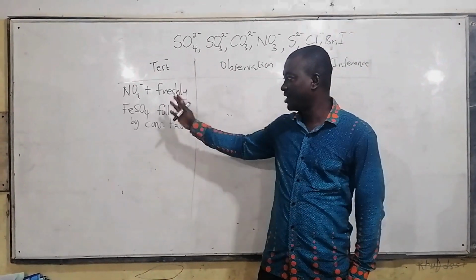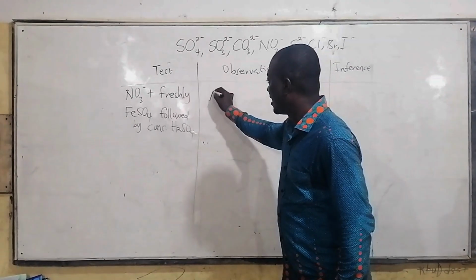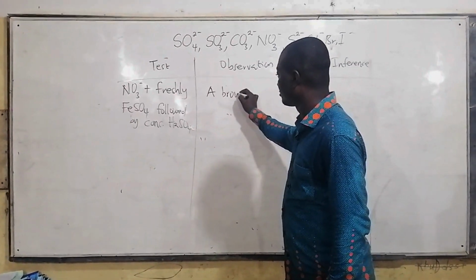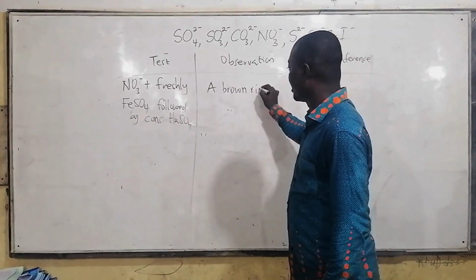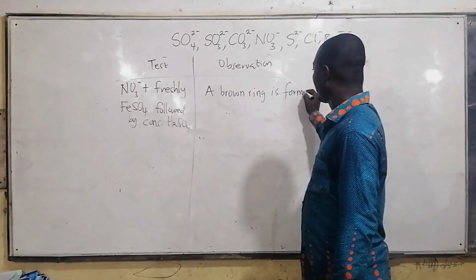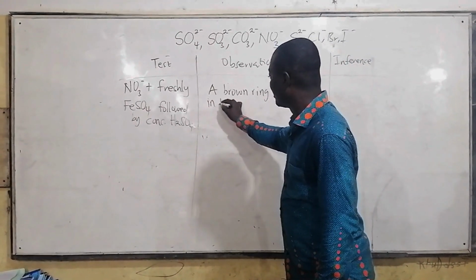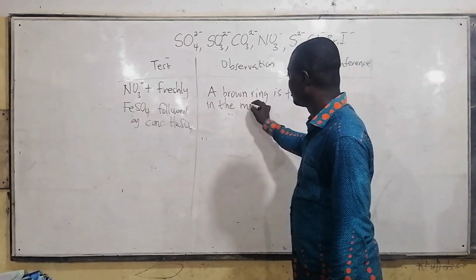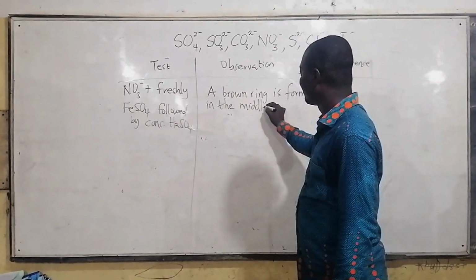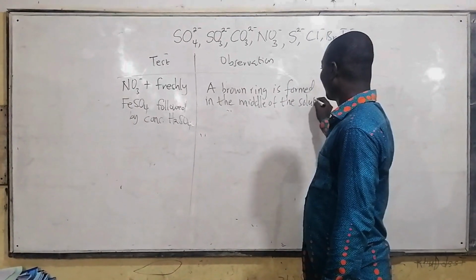When this is done, you're going to observe a brown ring formed in the middle of the solution.